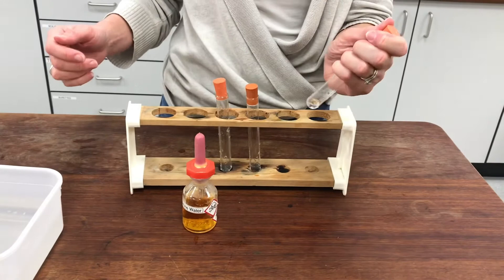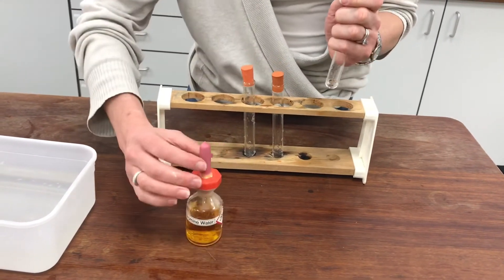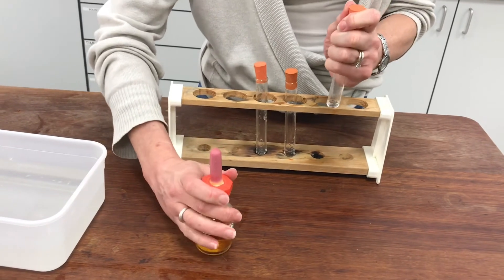So I would expect if this were an alkane that my bromine is just going to sit there and not be decolourised. So let's test it and see what happens.